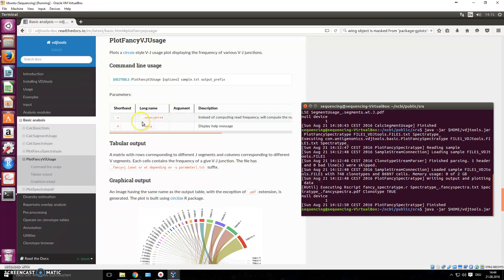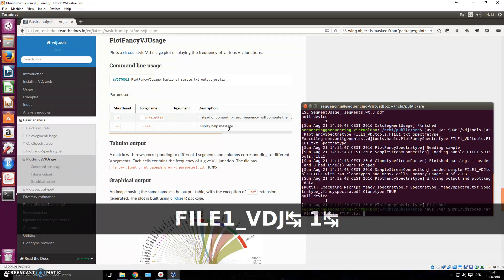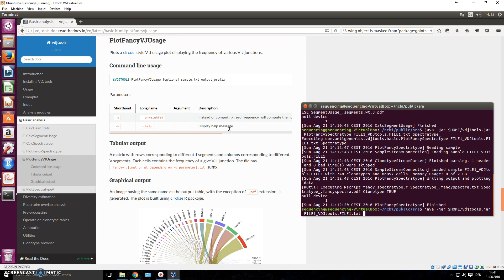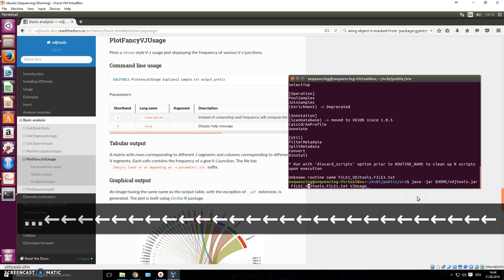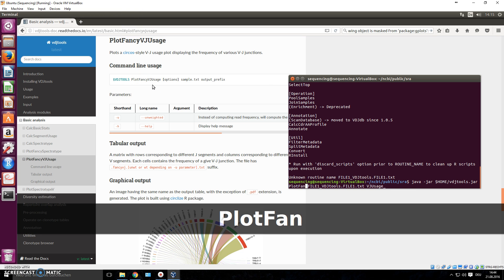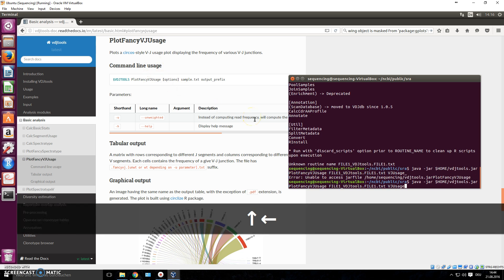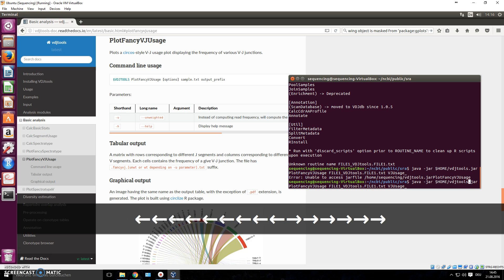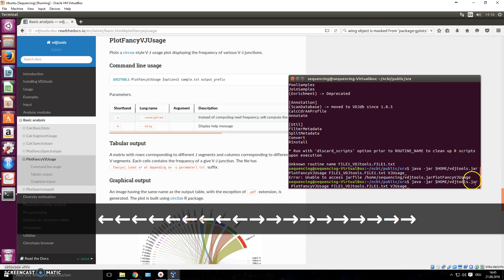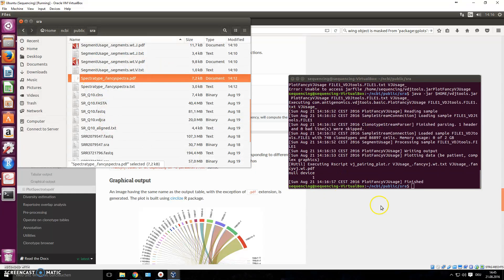Leave the default options and provide file one as input, then type an output prefix — call it 'vj usage'. I realized I forgot to include the routine name that VDJ Tools requires: 'plot fancy vj usage'. There's also something else wrong — let me check.